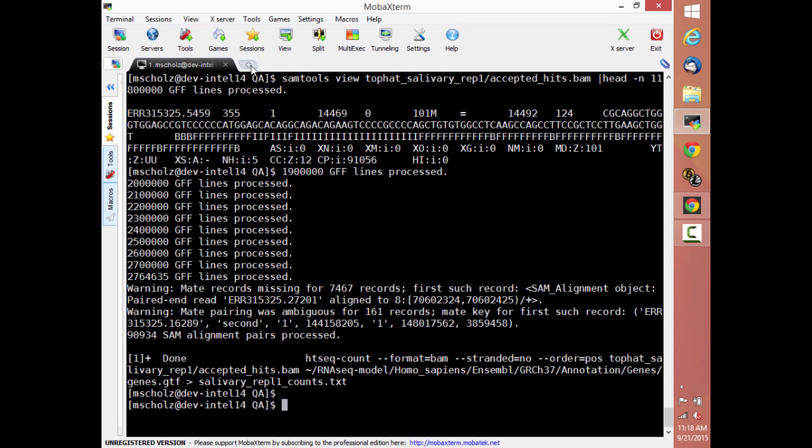Before I go forward with looking at what these results are, what should we do when we have slightly different results? This is another question. If you're going to run an analysis, somebody at some point is going to say, well, why don't you use a different tool to do the same analysis and then see which results make more sense, or do something with both sets of results? What do you do? So this is a question, and I'm putting this to all of you because most of you are the person in your lab that your PI is going to come to and say, do this thing. And so it is your job to think about how much work that means for you, how much value that gives, and what that actually is going to mean.